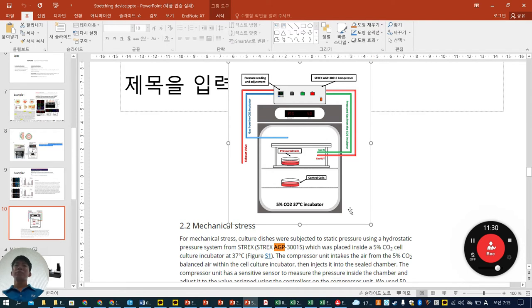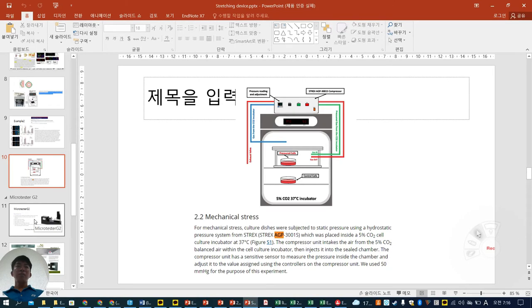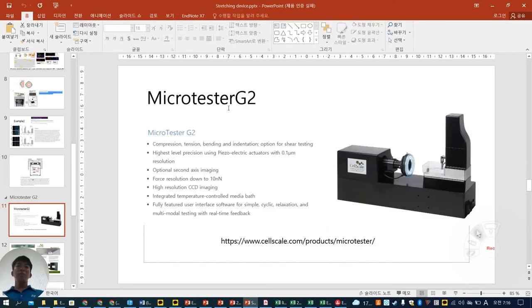맞네. 지난번에 그 왜 그 이동훈 박사 했고 뭐 그런 것들은 좀 바로 볼 수 있는 거 마이크로 사이즈 해가지고 현미경 달아가지고 바로 마이크로 플루이딕스 시스템 설명하고. Yeah, this is their system. And then second device is micro tester G2. This is, we can say, like micro scale measurement of stiffness or other mechanical property we can measure.